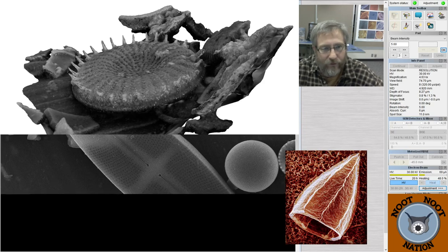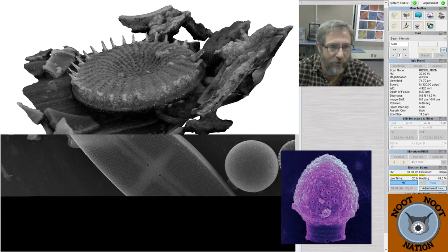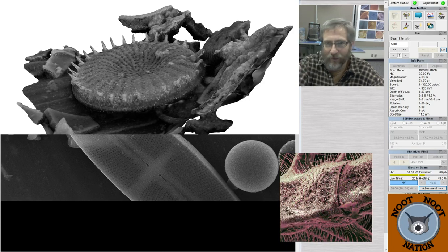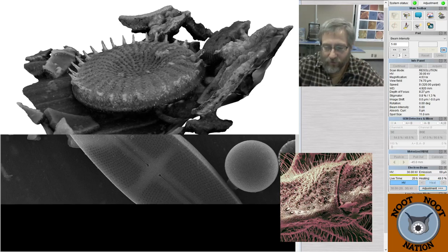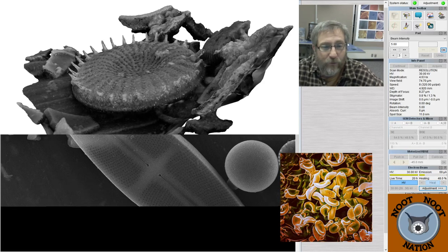And so then it created this thing, which is the version of it without a skin. So it doesn't actually have the image mapped on top of it. The little holes that you see on there are actual holes in the material, or depressions in the material, in the model. And that is this model that you can see, right? So this is what we printed, that image right there, entirely created by SEM images. And it's a pretty cool process.